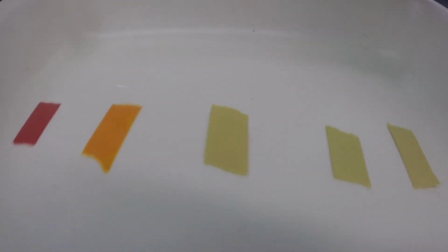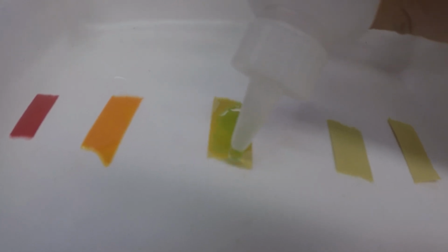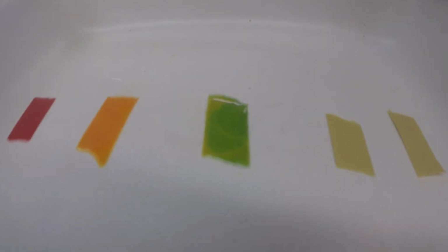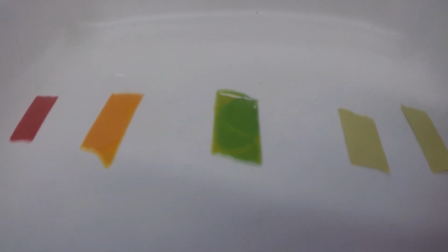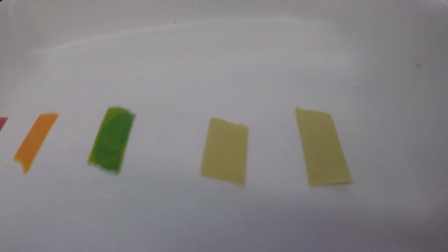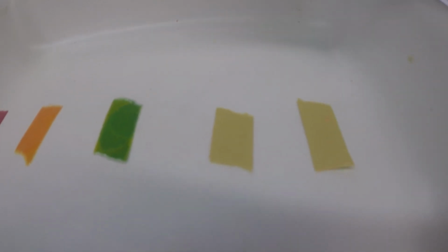Now we're going to do our neutral. Now we're going to do our weak base.